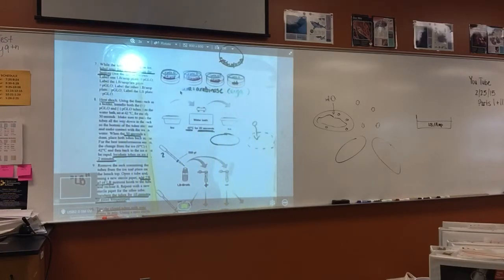When it says label your 4 agar plates, you need to label what's going to go in it, positive pGLO bacteria or negative pGLO. So that's what you are labeling, the positive or negative pGLO. And when you label it, you'll see when you get them that I labeled along the side. If this is the Petri dish bottom, I will have labeled it like this, LB amp, so you know that ampicillin and LB are in there. The reason I put it along the side is because when you look at the bacteria, you're never going to take the top off. We're just looking at the bacteria through the Petri dish, and you don't want that writing to be in the middle. So when you write positive pGLO and negative pGLO, you're also writing it on the side, okay?